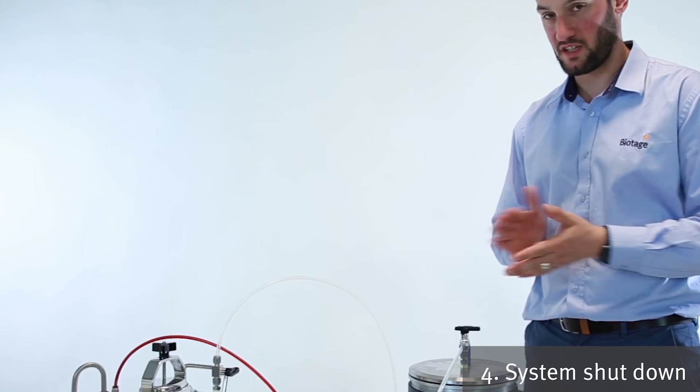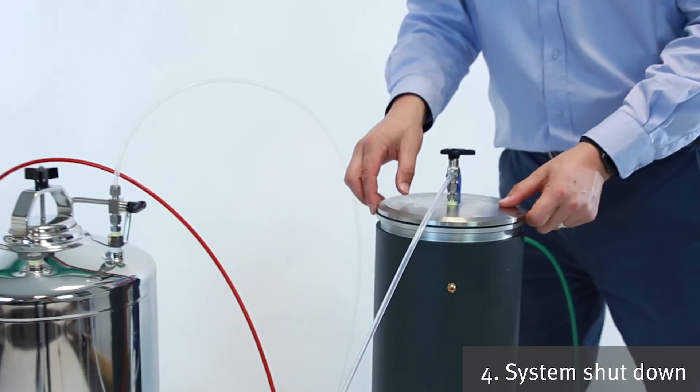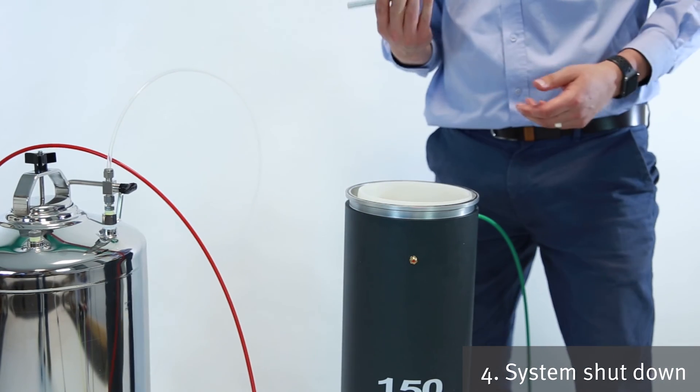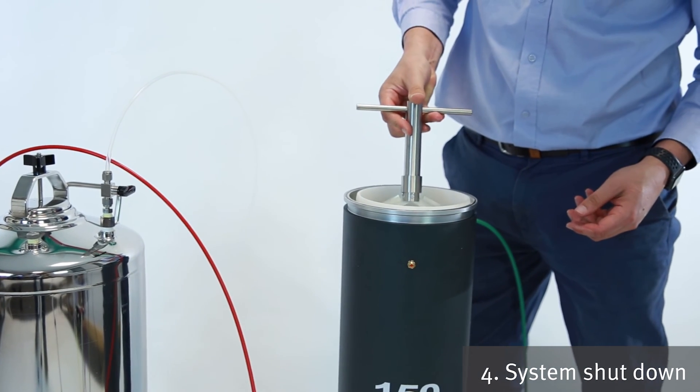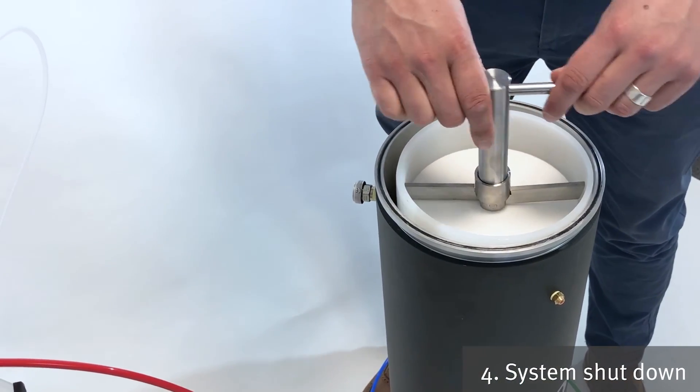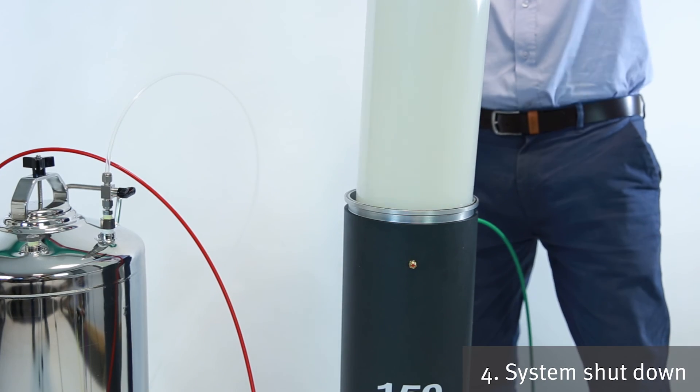Okay, so once you've finished your run and you want to take the cartridge out, take the V-band clamp off. Remove the head. And then you can use this cartridge removal tool which sits on the top of the cartridge. Push the band down and then you can lift it out.